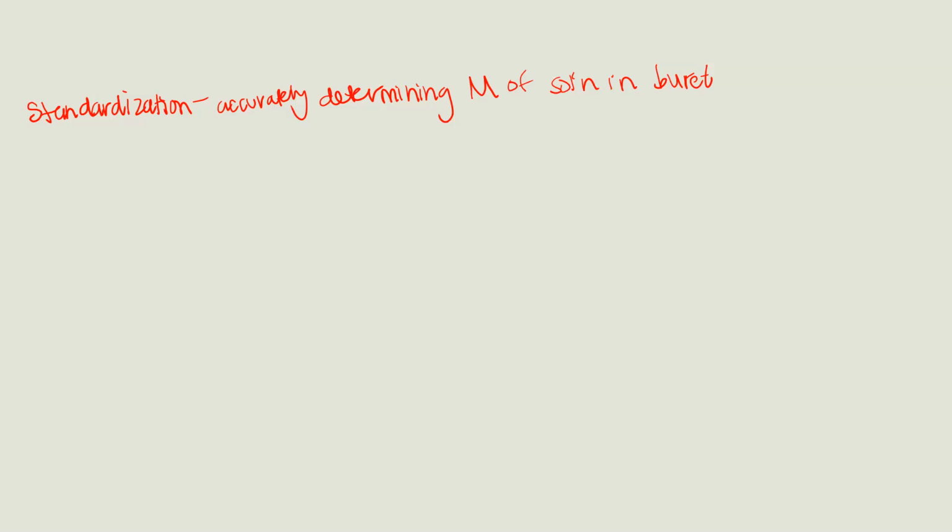For this lab, again, the chemical reaction that we're doing is between sodium hydroxide, so NaOH, and potassium hydrogen phthalate, which I'm going to write the whole thing out, and then I'm going to write underneath it or above it the abbreviation that we're going to use because it's long. Phthalate is a polyatomic ion, so it's not like it's difficult. It's just not a polyatomic ion you're used to dealing with.